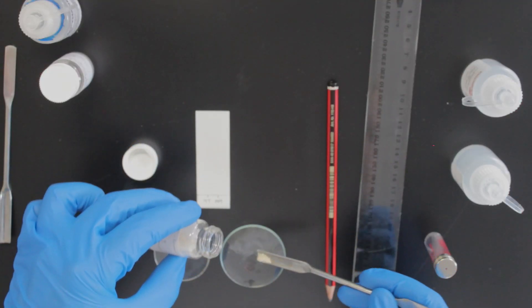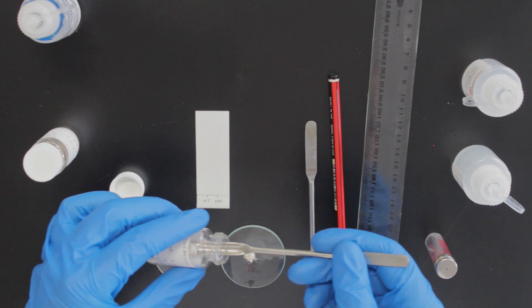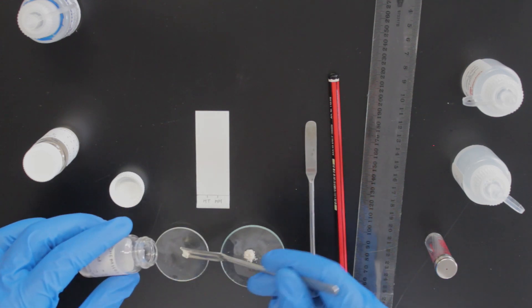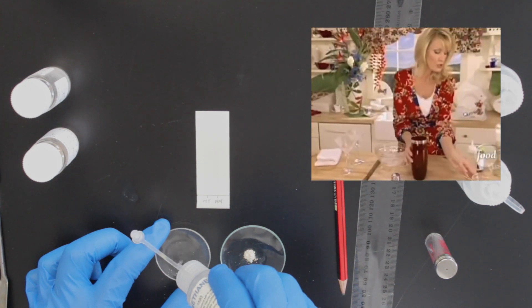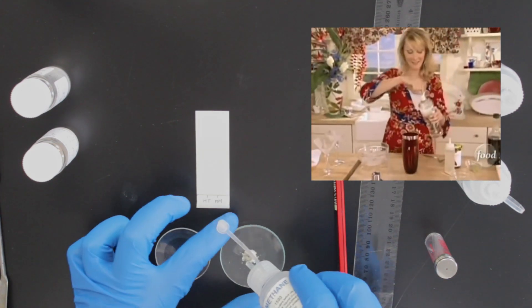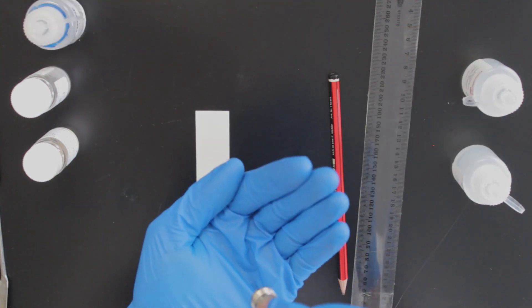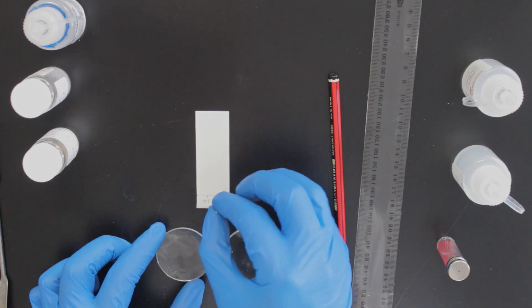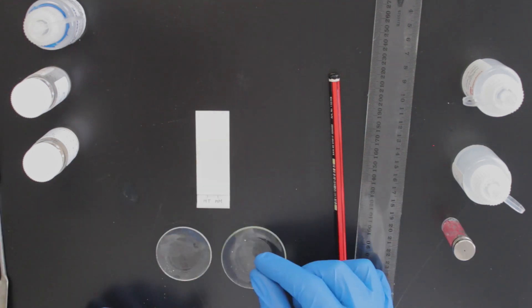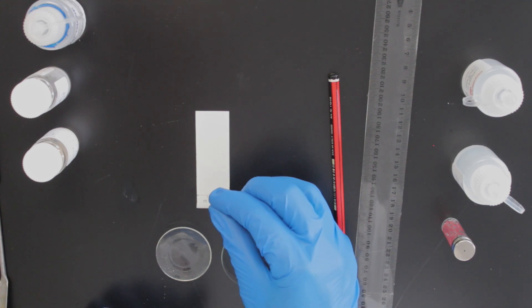Now let's load on our samples from part 1 and 2. Use a spatula to move a tiny bit of each sample onto two clean watch glasses and dissolve the solids in about three drops of dichloromethane. Repeat the same process as before using a capillary tube to spot your samples onto the plate. You'll need to work quickly since dichloromethane tends to evaporate if left out for too long.